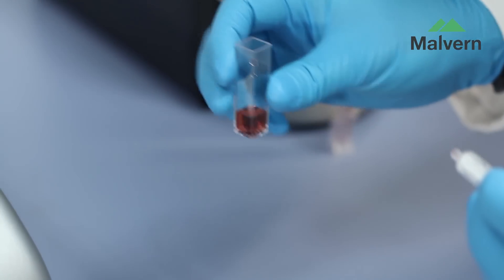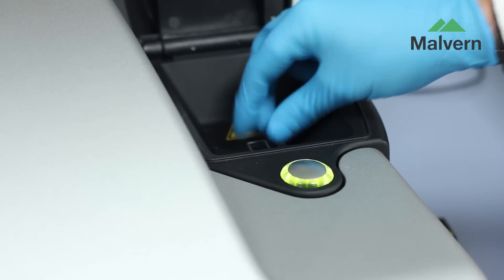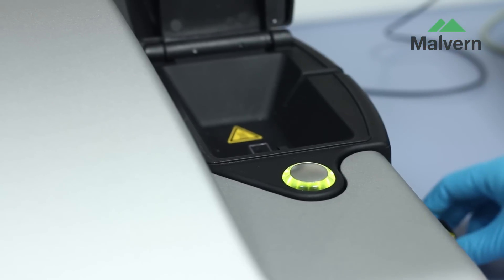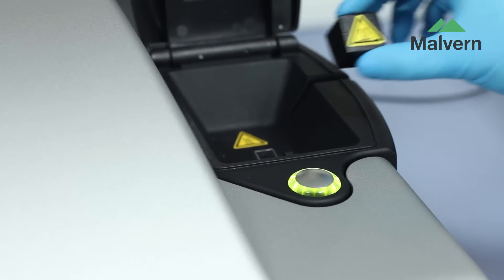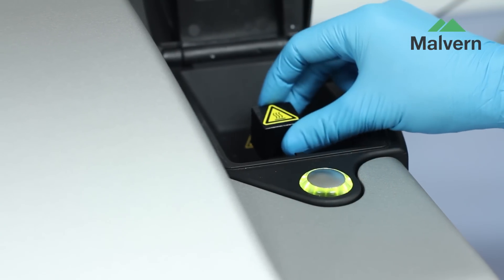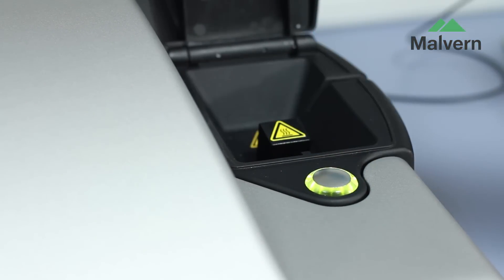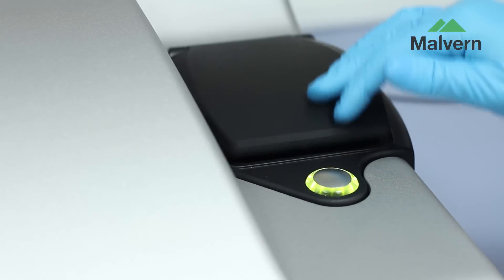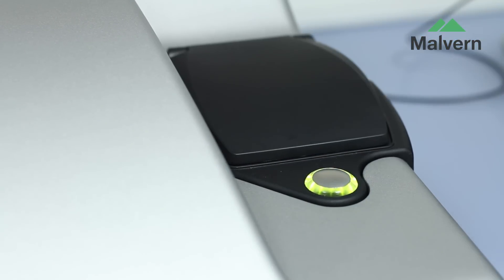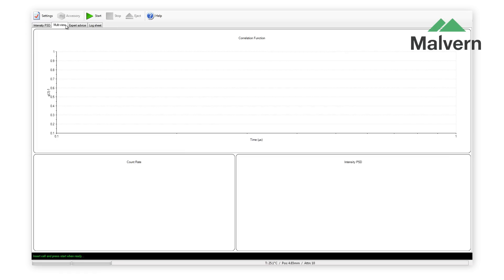I will now demonstrate how to make a size measurement. After filling the cell, it is inserted into the instrument, the heat cap fitted and the lid closed. Clicking this button starts the measurement.